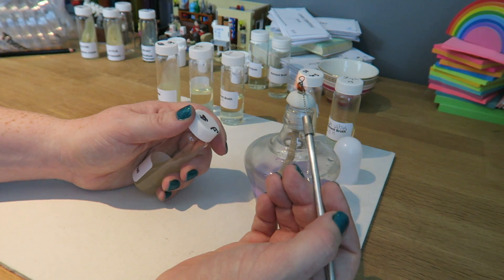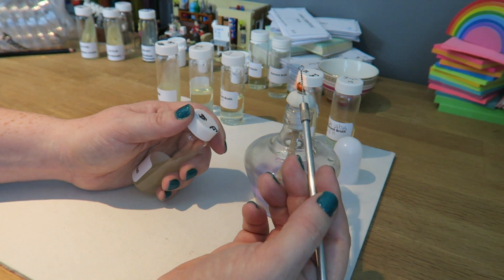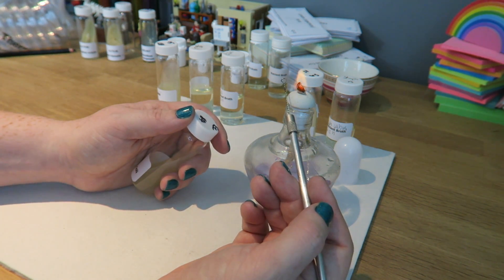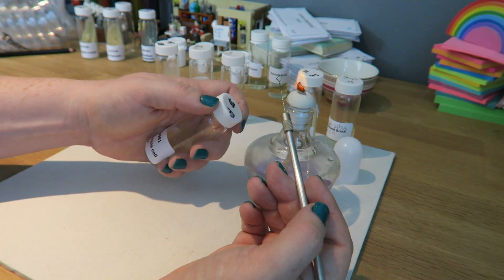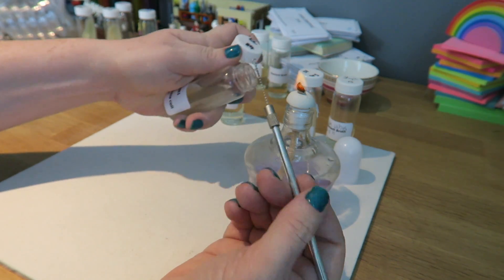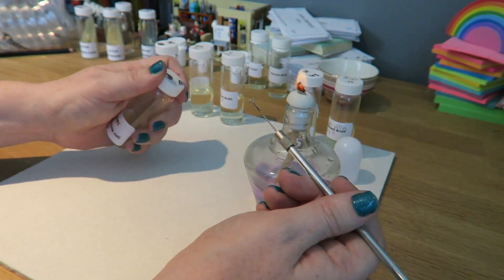Flaming the loop completely to kill anything that's on there so it's glowing red hot again, all the way down the inoculation loop. Again leaving it to cool, but next to the flame so that it doesn't pick up any bacteria from the air and also doesn't get too hot to kill anything. Opening the tube that has my culture in it, flame the lid, get a sample, flame the lid, close it.